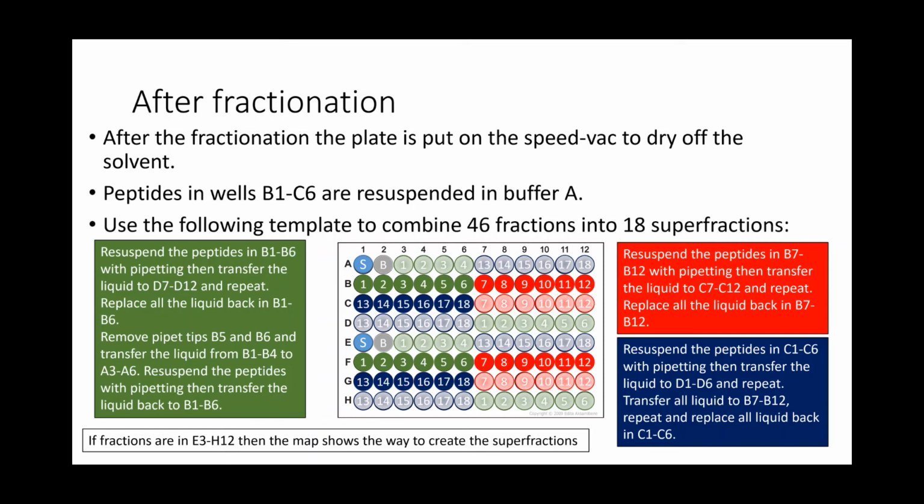And if you have run 2 samples, then the second part of your plate, which would be sample E, your second sample would start at E1, and you would do the same thing with E3 through H12 as it's shown there in the color.